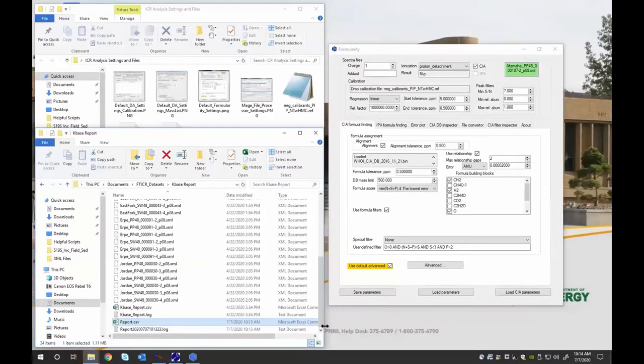And it's because whenever a sample calibrates badly, what basically happens is its mass is always offset from all the other masses. Again, the whole point of calibration is to ensure everything is under the same framework, air quotes, framework. And if you have samples that aren't in that same framework, they're going to appear wildly different. And they do. Under multivariate analyses or things like that, they always appear almost 100% different from samples that do calibrate well. So we do have ways of identifying them and controlling for them, though.